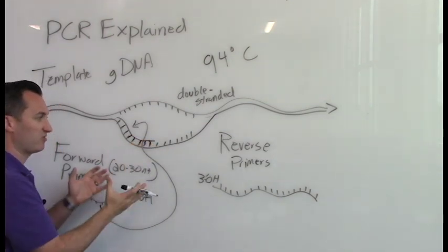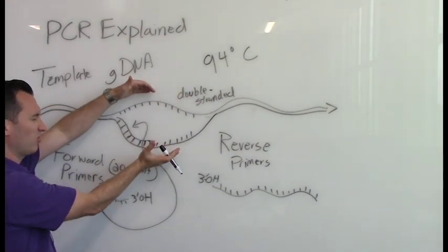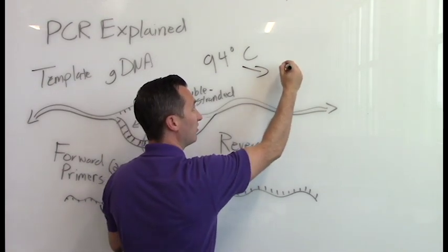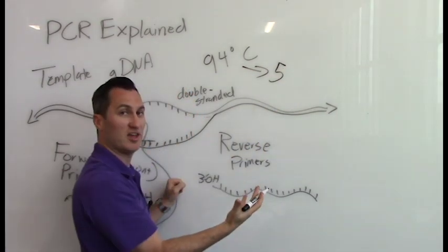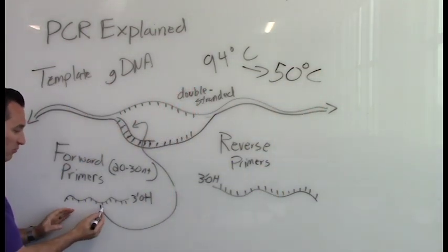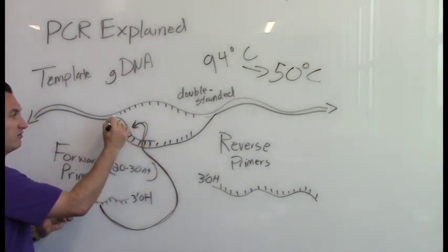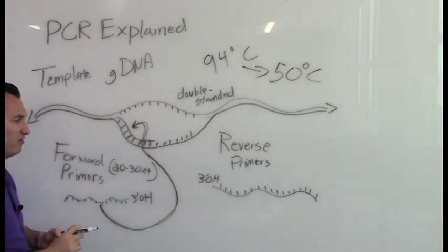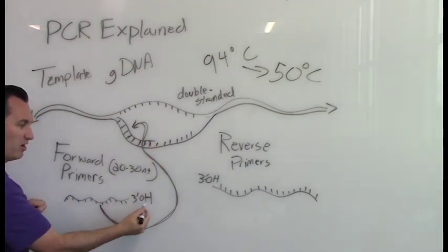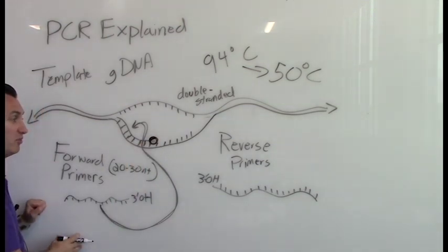Okay? So that first step in PCR is to heat to 94 degrees Celsius, thus opening our target. We then very quickly cool to maybe a nice low, in chemical standards, temperature of, say, 50 degrees Celsius. That allows the primers a selective advantage for that site, and they get here before the DNA closes back on itself. Okay? So that's where our forward primer will be. Notice that there's a 3' hydroxyl group at that tailing location. That will become important.